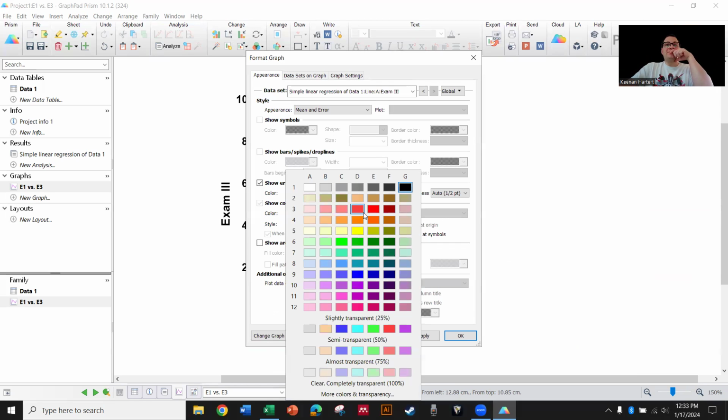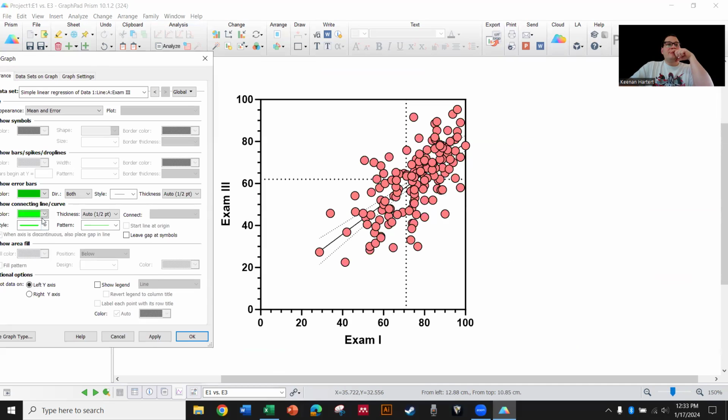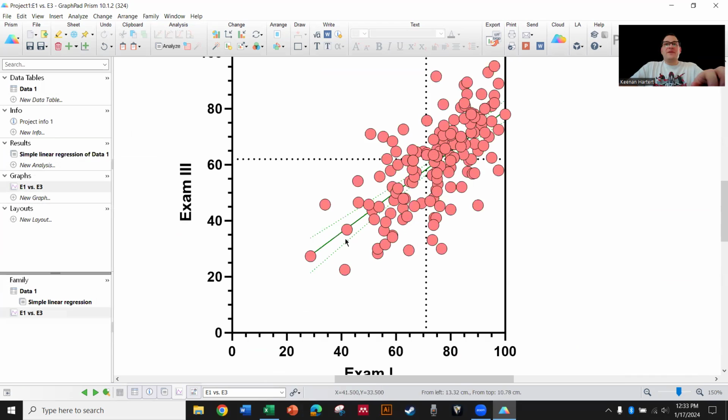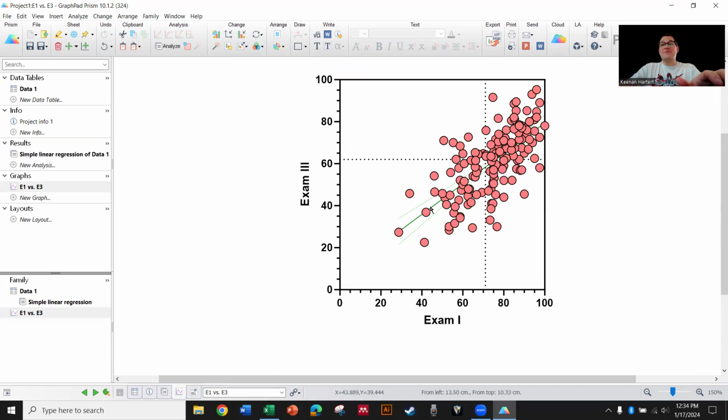In this case, let's say I wanted to make this some horrific green, I don't know, like that. Let's do dark green right there. So see how, in that case, I added kind of that color to things. This is looking pretty gross right now, but hey, I'm trying to get everybody's attention. I'm not gonna spend time on it now, but if I wanted to, I could probably crush this. I could probably start this axis at 20 and this at 20 to kind of shave some off, but there's never anything wrong with having double zeros down there.